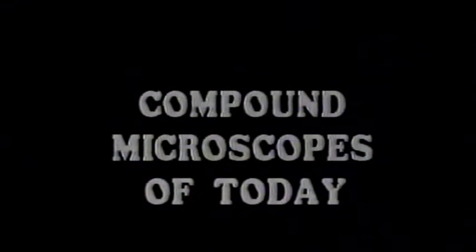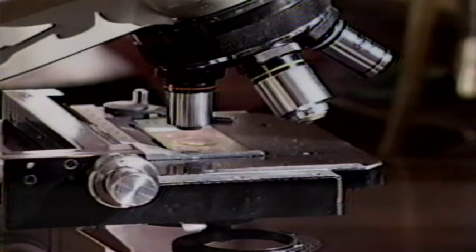The compound microscopes of today still rely on the same principles employed in the 17th century. Very thin specimens, mounted on glass slides, are placed in the path of a beam of light.